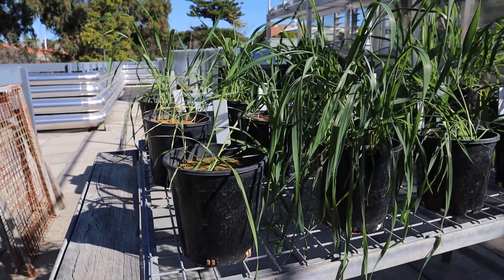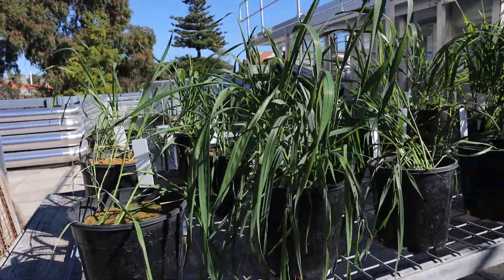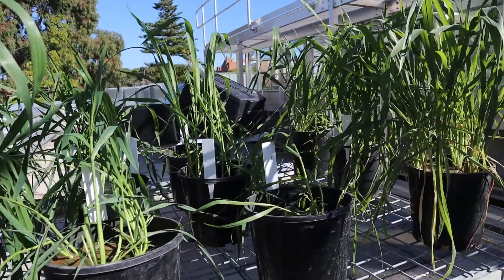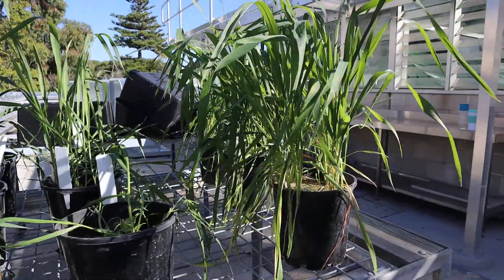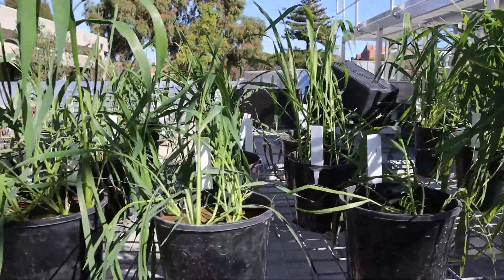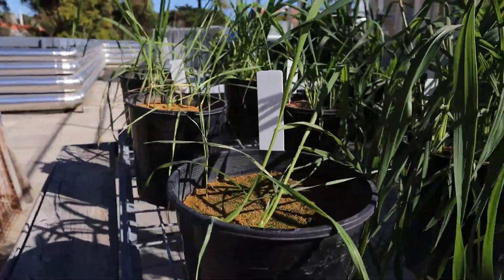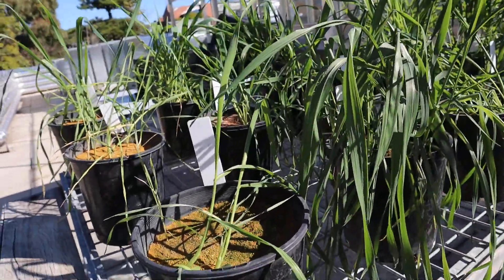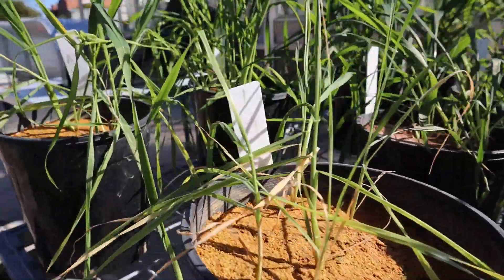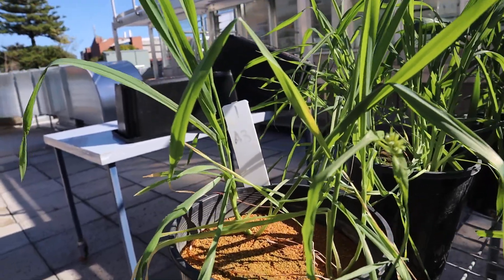We're going to look at group one's pot experiment. There's a lot of good growth in many of the pots, but we come back to soil A and the plants are not looking so great — except in this pot, which is probably the best-looking pot of any of the soil A plants in the entire class experiment.